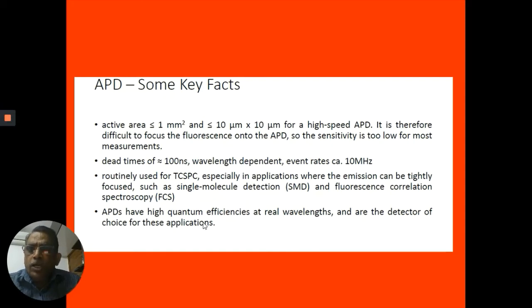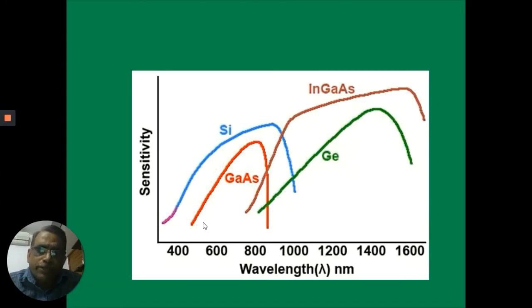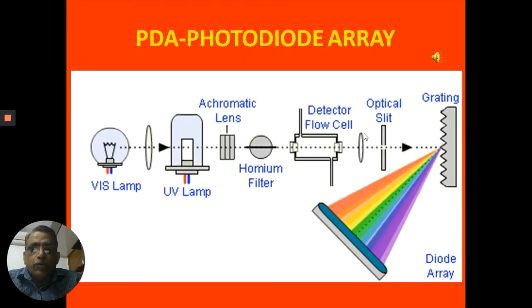You can use a normal diode also, photodiodes. So you can have diodes for a set of different regions of wavelengths. Silicon photodiodes, gallium arsenide photodiode, germanium, InGaAs photodiode. So like this, photocathode materials really decide, as we mentioned about the photocathode materials in the photomultiplier tube. Here also the materials that they use, they really have these junction materials. They really decide the spectral sensitivity of the photodetectors.